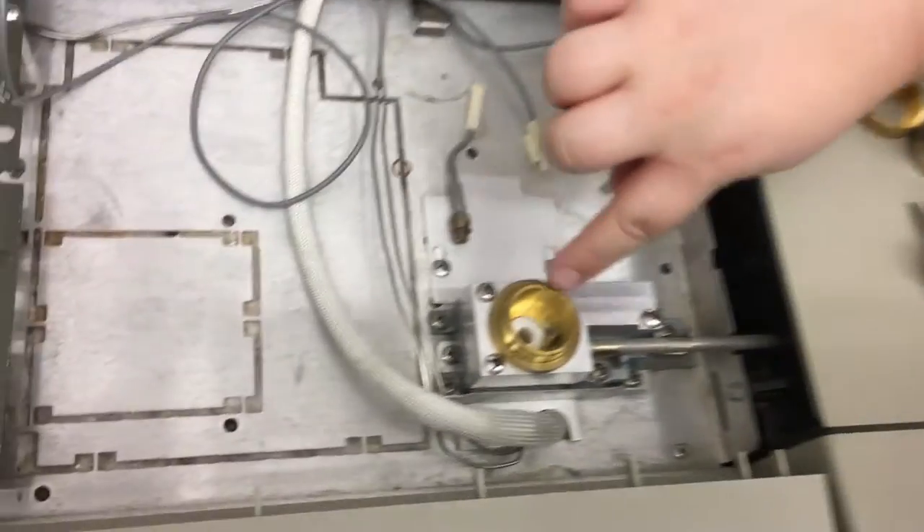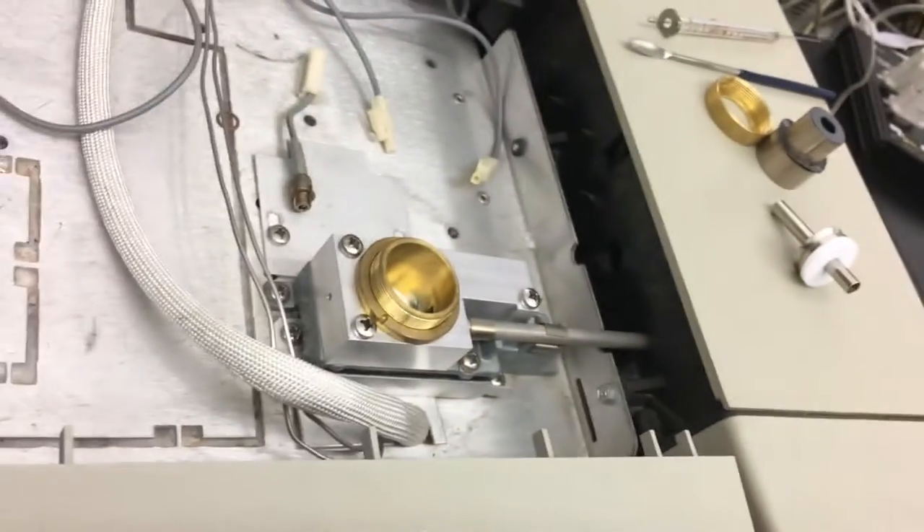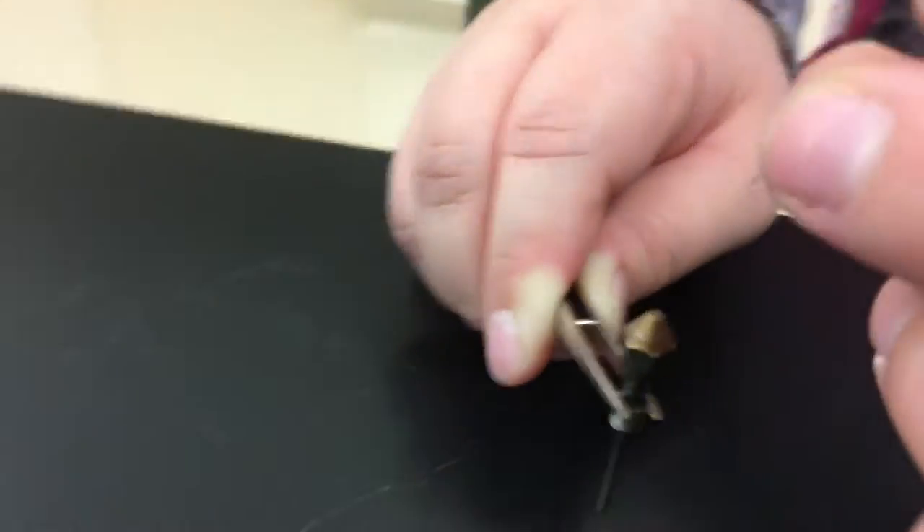One of the main components of the flame ionization detector is the jet, which is shown in the case. This piece will need to be removed and cleaned as well. Once the jet is removed from its unit, it will appear as shown.